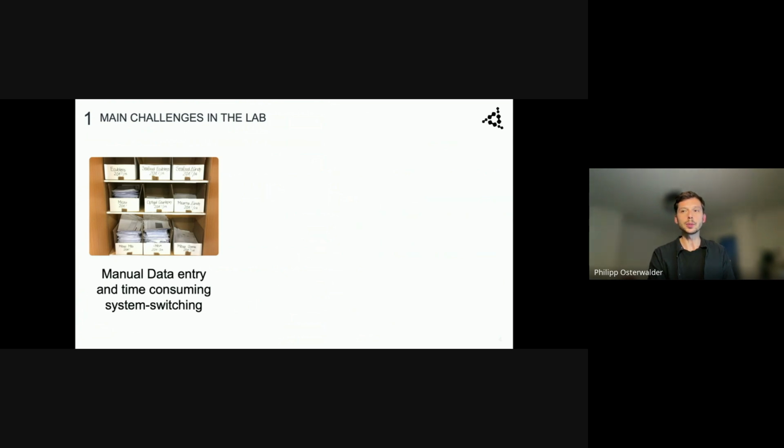Even some advanced users of LIMS are still printing out their raw data sheets manually, writing down their results and measurements, calculating some ridiculous numbers on the paper, and then opening up the LIMS through their smartphone or even their tablet and entering their values.